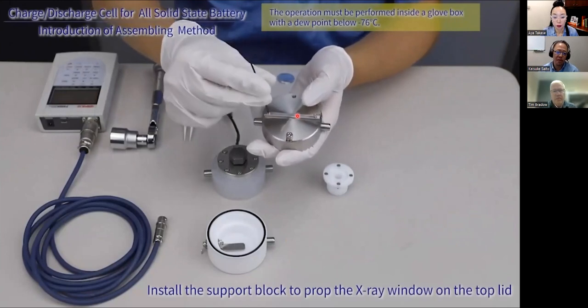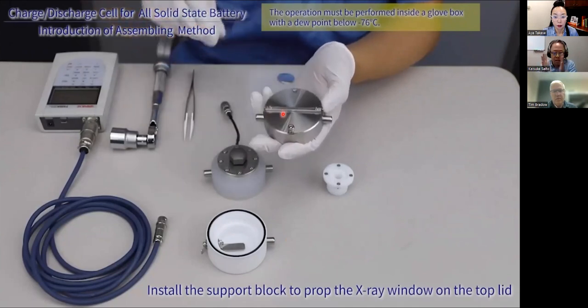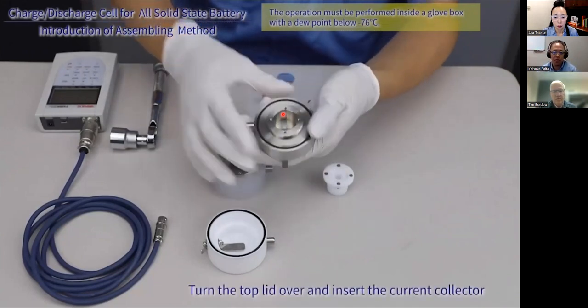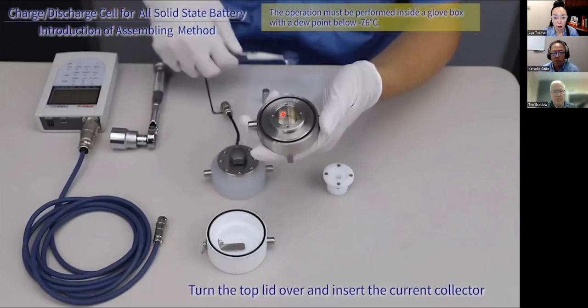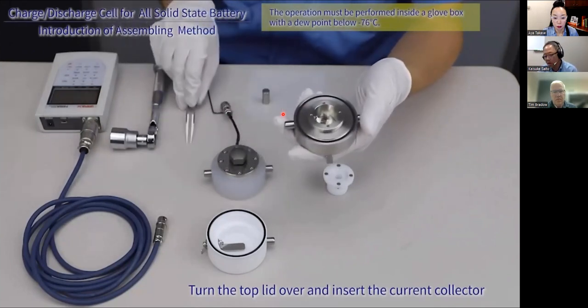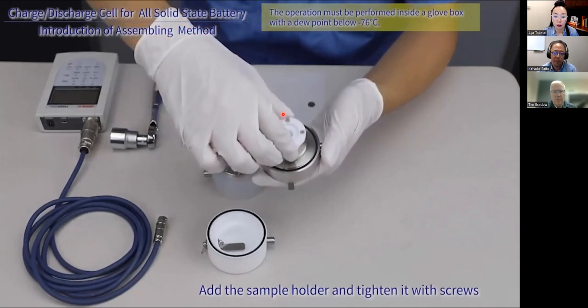This is actually protecting a very thin window for X-ray, because we are going to pressurize when we prepare the sample. This is just protecting the window. So when you measure XRD, this must be removed. Now we are putting a current collector or X-ray window. This is aluminum. And then we put the sample holder.